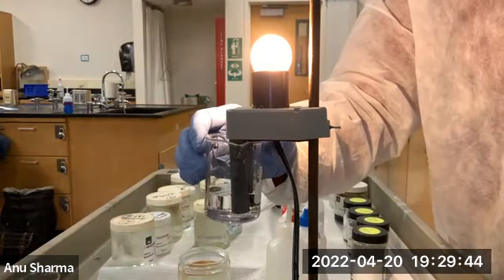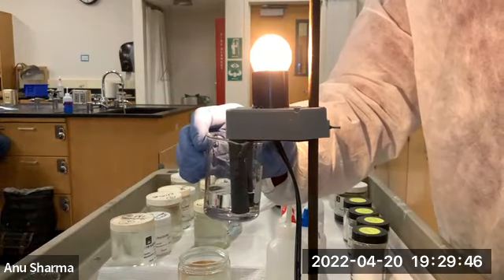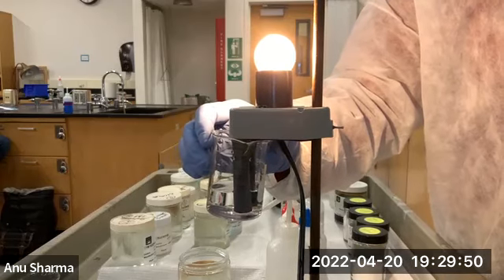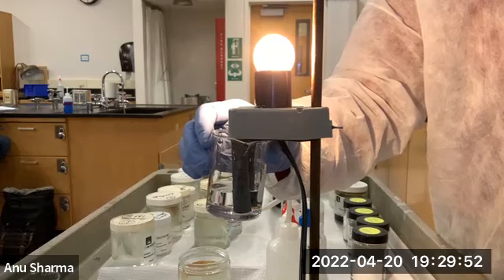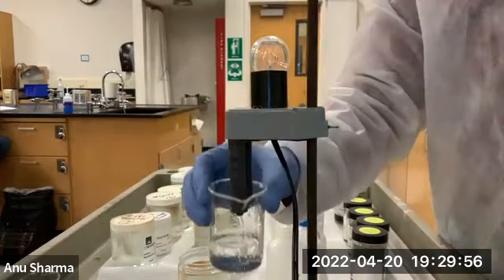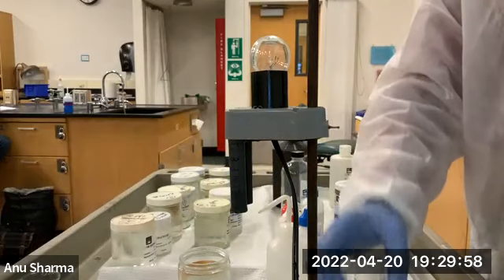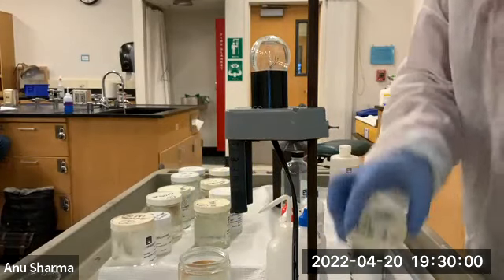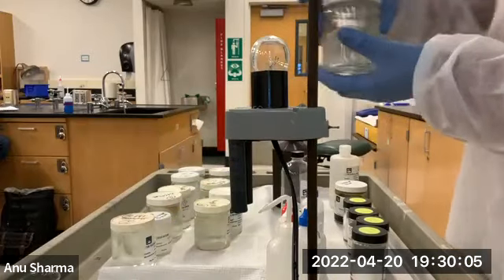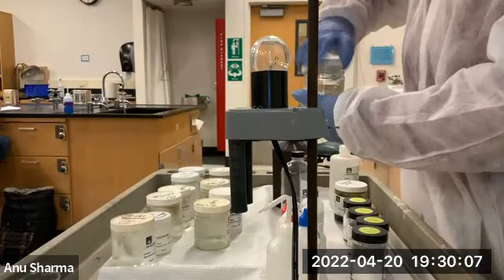And look at that. What is that? Strong electrolyte. So 2 weak electrolytes make a strong electrolyte. You see that? What a glow of the bulb, very nice and clean. So the molecule that is formed is actually ammonium acetate.